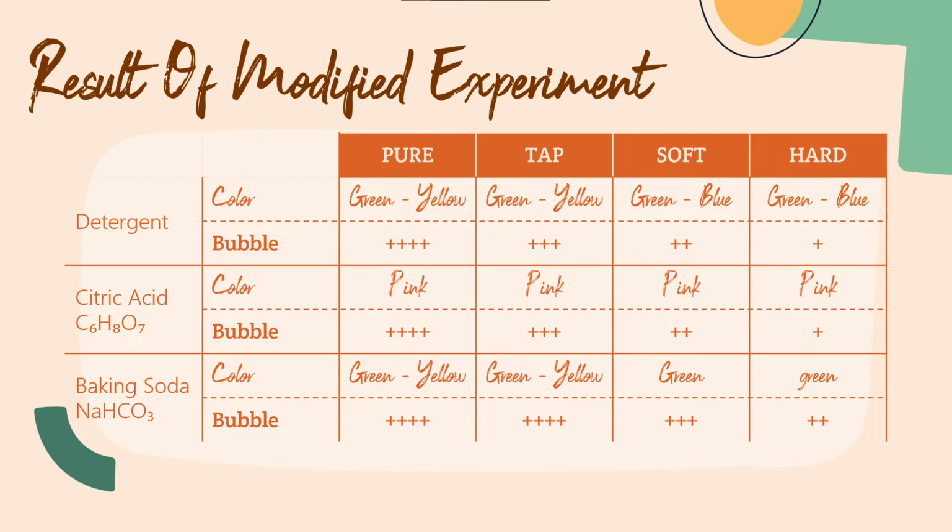In chemistry, pH is a measure of the acidity or alkalinity of an aqueous solution. A pH below 7 is acidic, meanwhile above 7 is alkaline. The pH scale of the commercial pH indicator that we use is shown here.